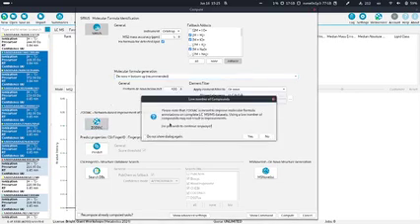Zodiac, we already talked about this and about this pop-up you get when you select it. Because here we have just selected 6 features, which is a very low number, so probably here it would not make sense.